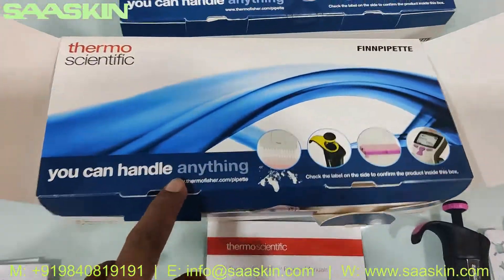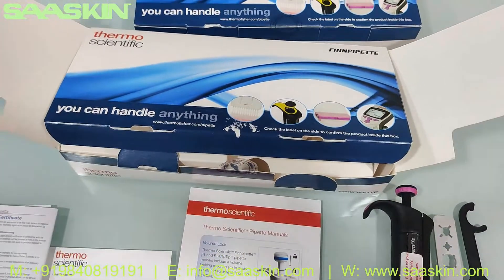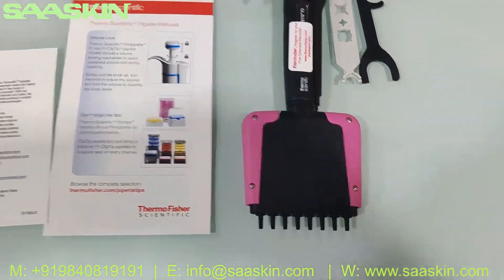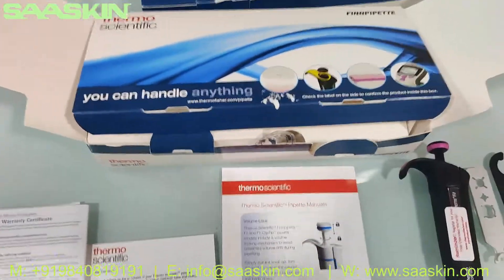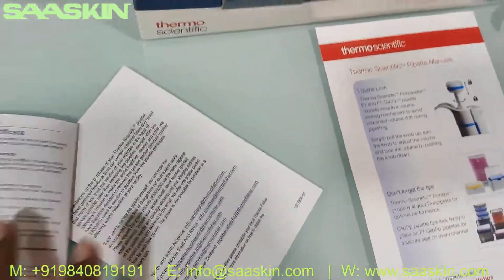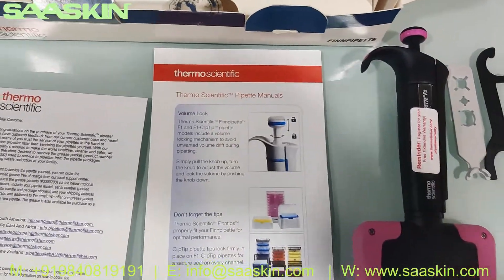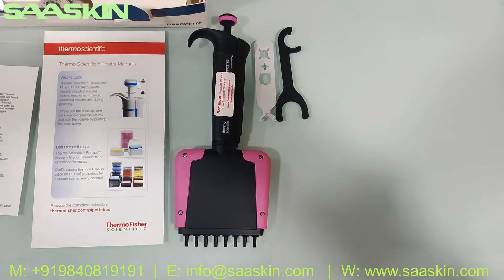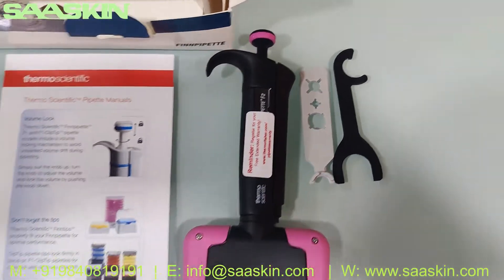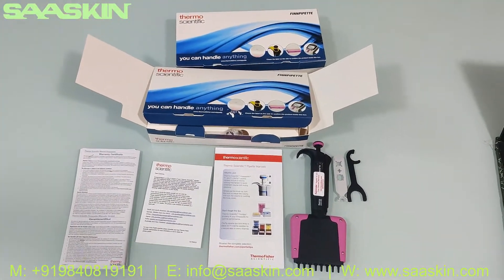To quickly summarize: this is the Thermo Scientific fine pipette F2 multi-channel 8-channel model. The box contains the warranty certificate, calibration report, customer welcome kit, the manual, the actual pipette, and the keys for fastening and unfastening during any repair required. This is the complete introduction about the kit. Thank you.